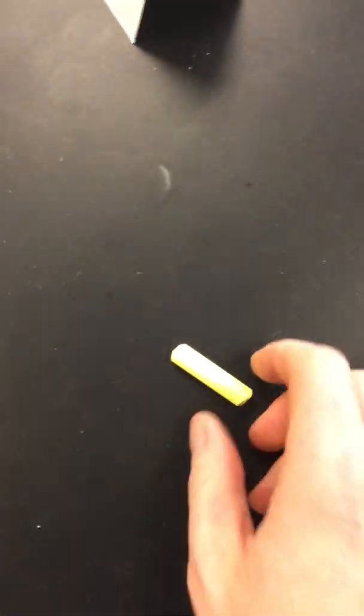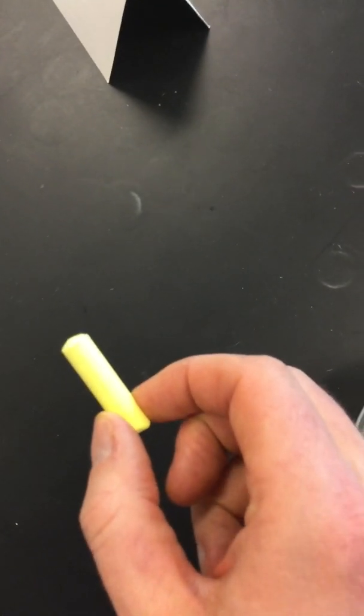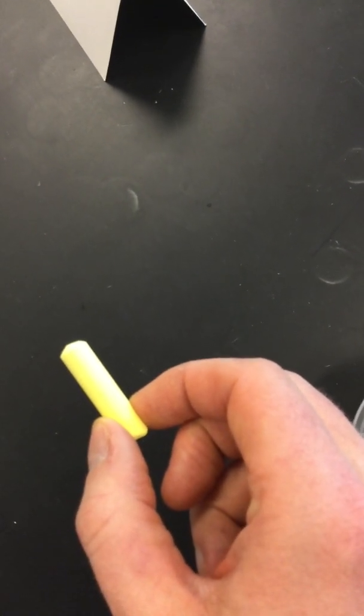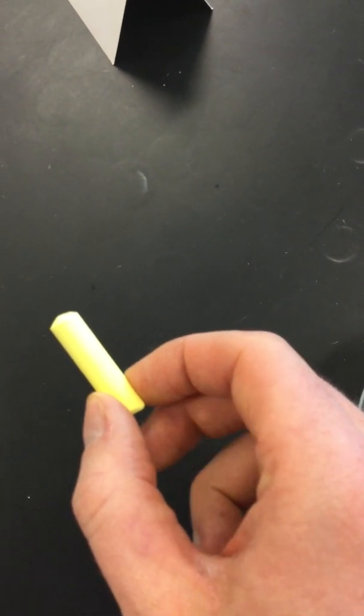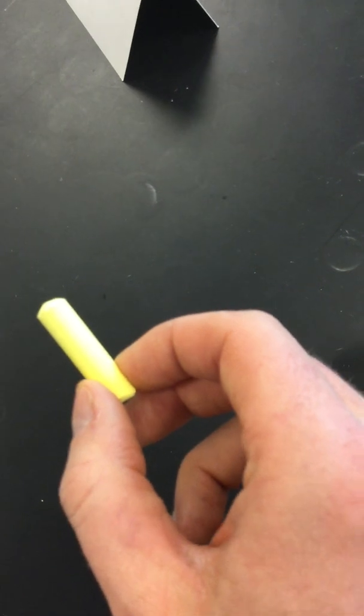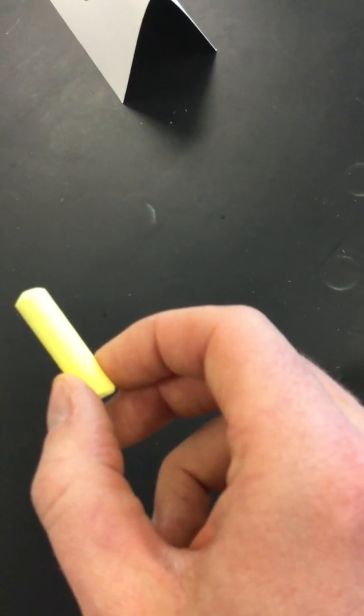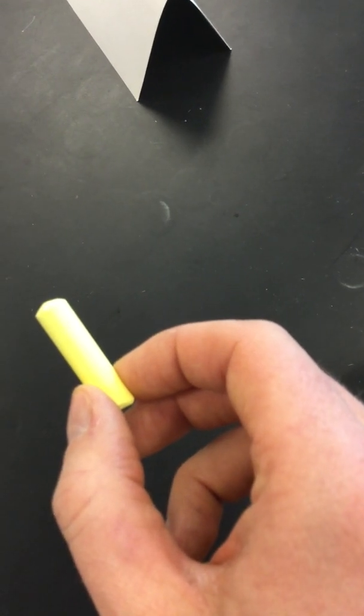Once you pause the video and come back, I can tell you that this chalk, I tried it, weighs 4.664 grams. I then wrote my name on the chalkboard, and it has a new mass of 4.139 grams. So before I wrote it was 4.664, after I wrote it was 4.139 grams.